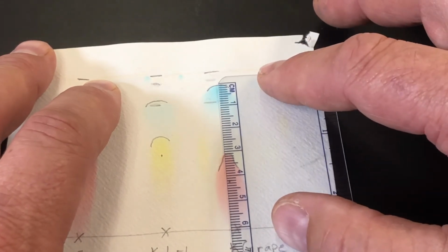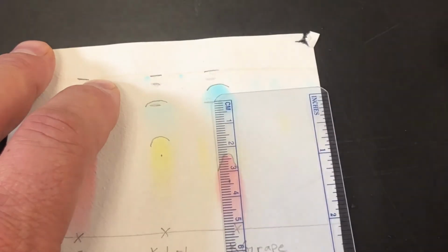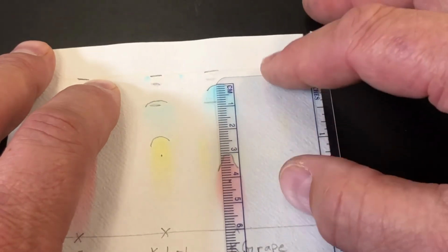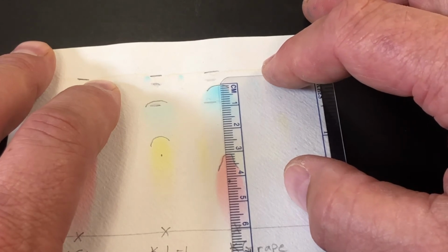Okay, for the grape, we had a total distance of the solvent traveled 6.60. The tip of the blue, again, if you're doing these in tables, the tip can be one column, and then the center mass for the blue can be another column. So you can do two different RF factors and see how that works for you. Or you can just throw one out if you don't like one.